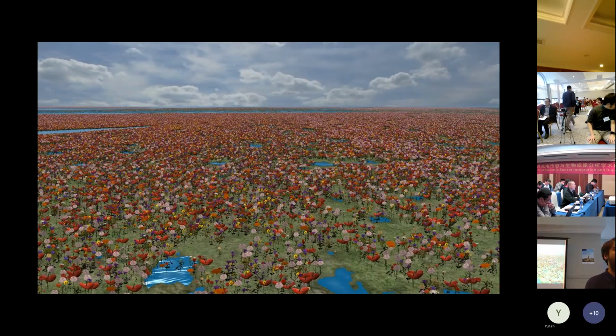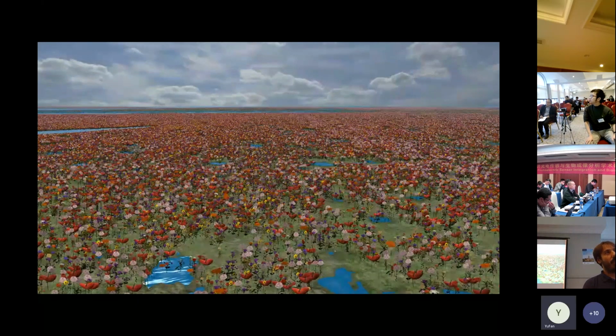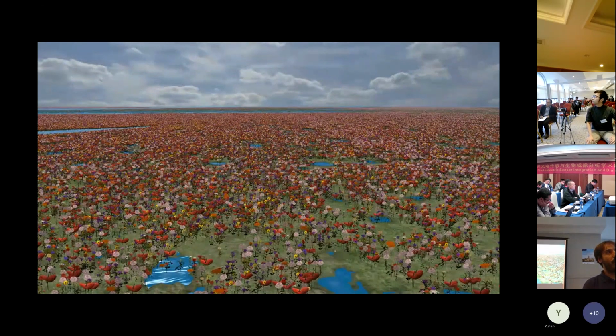You take so many images, will it take a long time to process and map them? For pre-processing only, maybe a couple of hours, if I remember correctly.